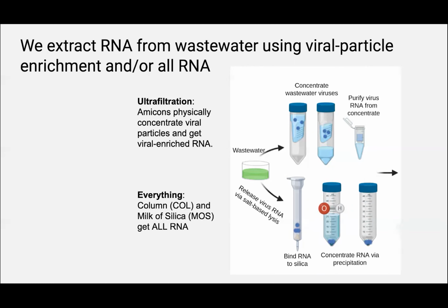A couple of notes about this method: first, it is going to try and enrich for viral particles. Free RNA and free DNA will generally pass through the filter. We try and lyse bacterial cells before we get to this point.